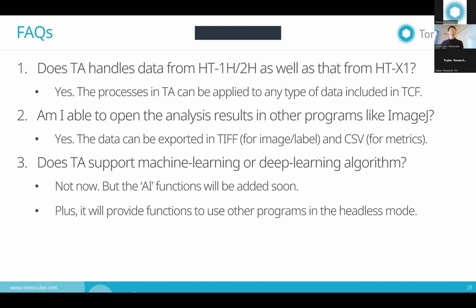During the process of reconstruction, it involves deconvolution.